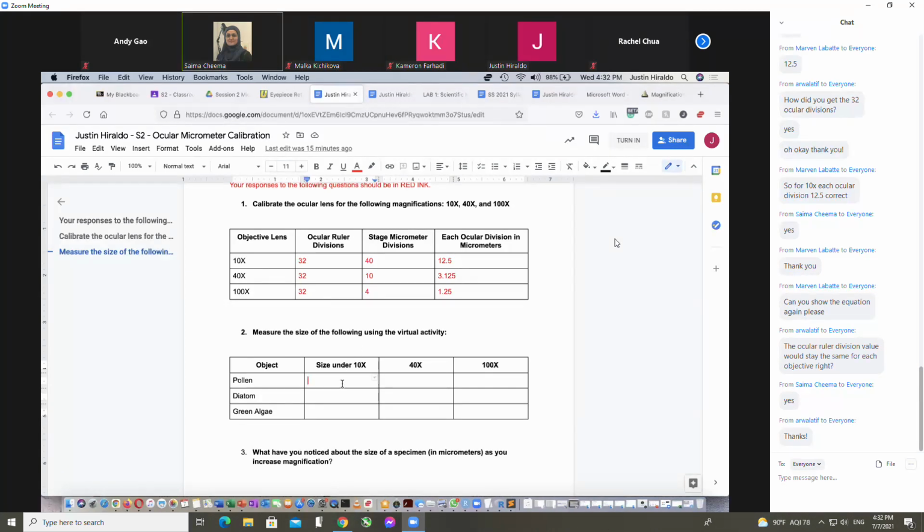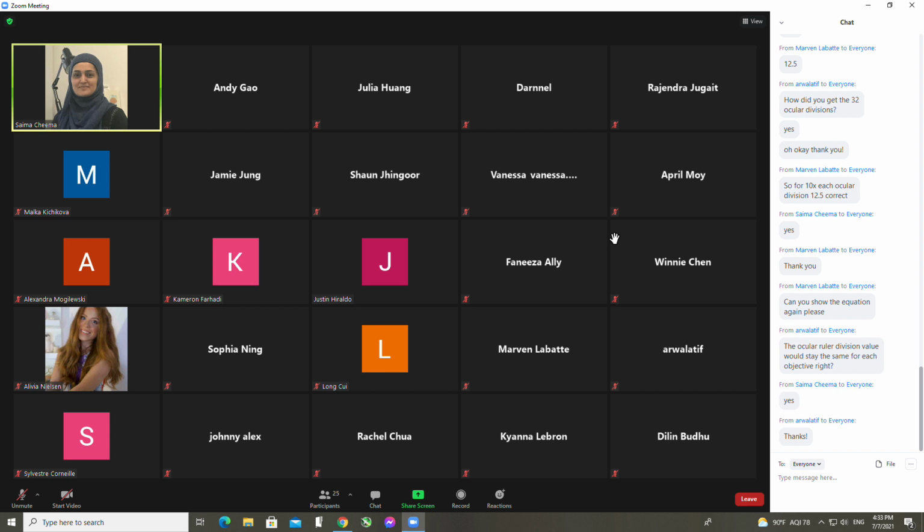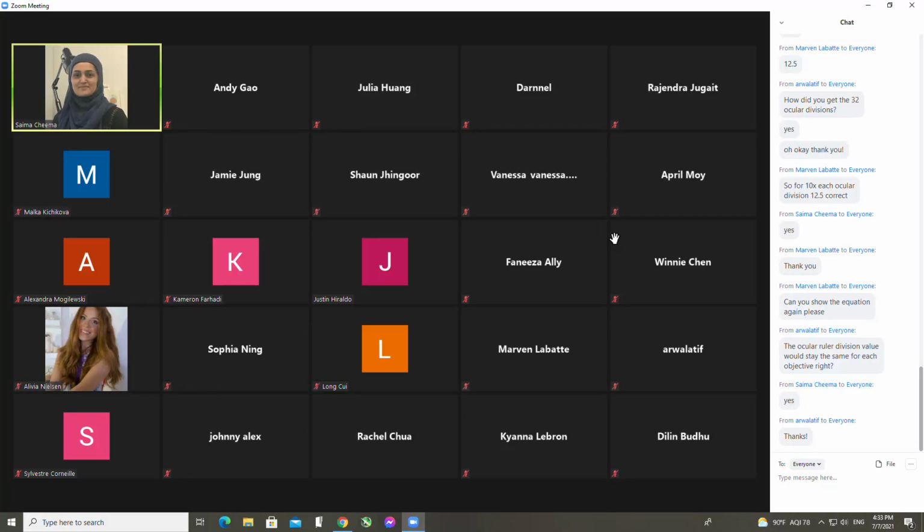Yes, that will be 50 micrometers, that's exactly right. Okay, so I think I'm going on the right track. Yes, and then you want to measure the same one under 40x and 100x too, right? Exactly. Okay, thank you, Professor. Do you still want me to go over it or are you good? Yeah, I'm good. My problem is solved. Thank you. All right, awesome.